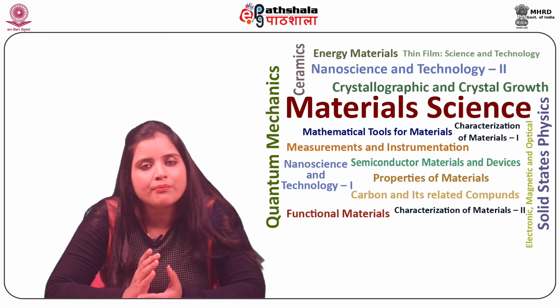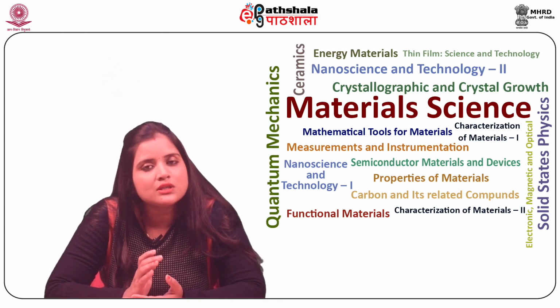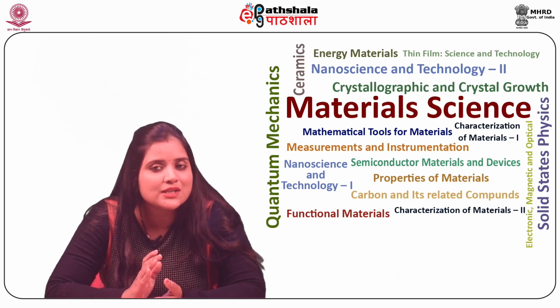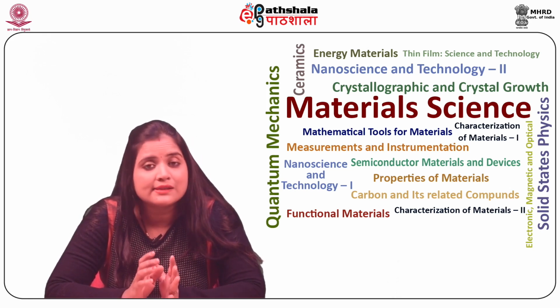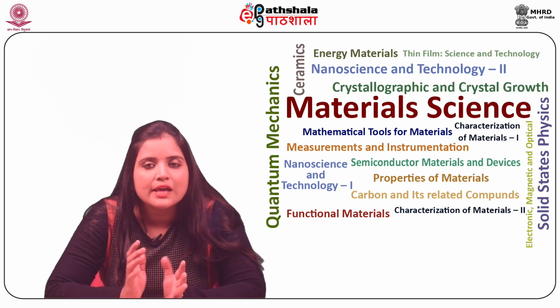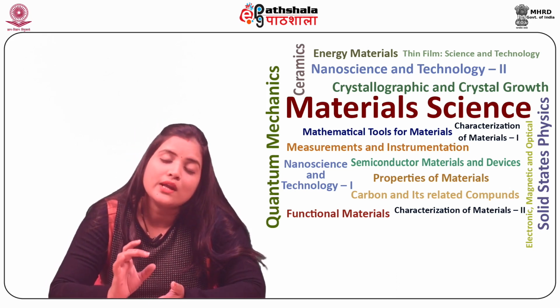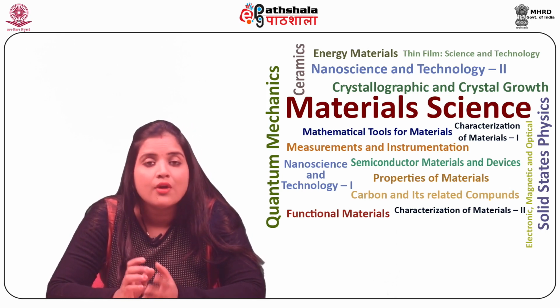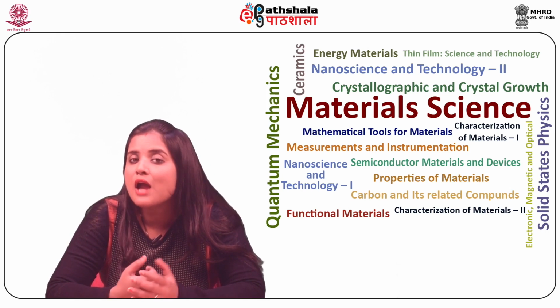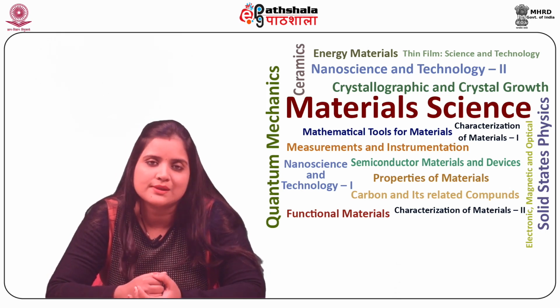Also, for carrying out scanning tunneling microscopy, the surface must be very stable and clean. All STMs require extreme vibration control as well as very sharp tips. Also, the equipment is highly sophisticated and is quite expensive.